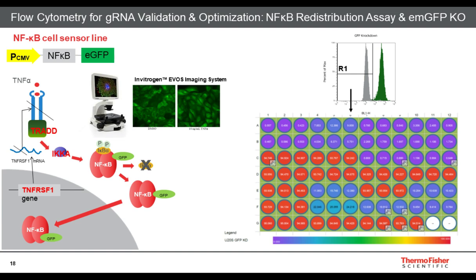Along the same lines, but switching gears a little bit, I've talked a little bit about guide RNA validation and optimization. A lot of times we're looking at the overall knockdown, but sometimes we're trying to create nice assays to measure our efficiency. Let's say we're trying to optimize a guide RNA design or a certain type of guide RNA purification or what have you.